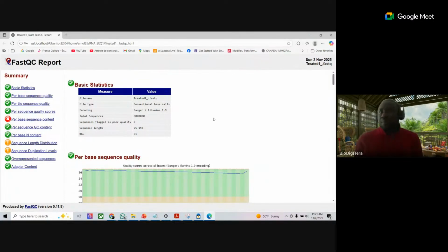It's not knowing the commands that shows you are a good bioinformatician. It's your ability to say, I took the raw data, I downloaded the raw data, I checked the quality, and I can tell my manager if the quality is good or not. After this class, you should be able to do that.